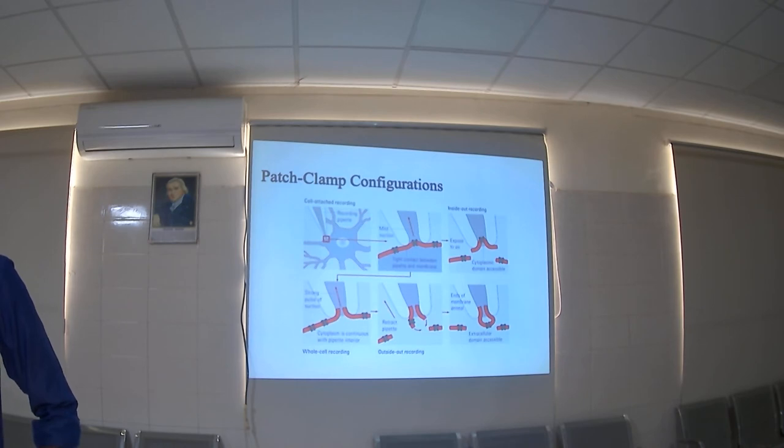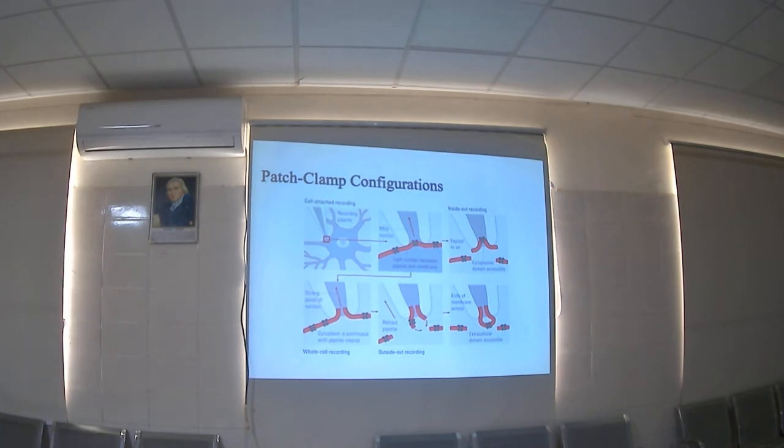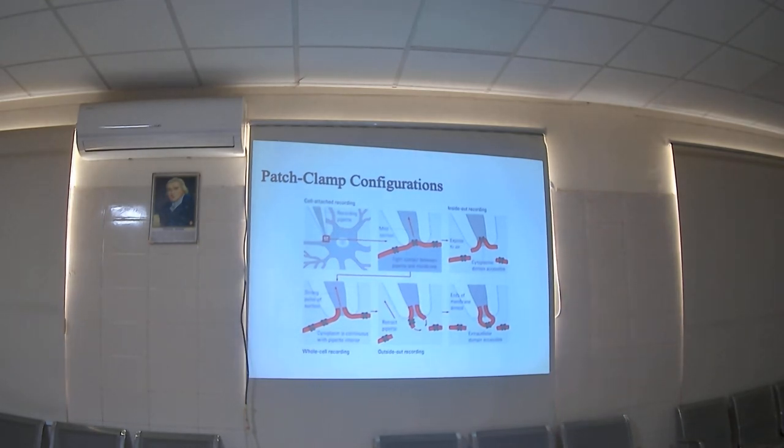Real time recording मतलब how the electrophysiological property inside of a cell is affected in our experimental condition. Experimental condition, तो आपको पता है ये क्या हो सकता है? As a pharmacology student, you can test a drug, how it is actually affecting the inside of a cell. ठीक है? Electrophysiological property.